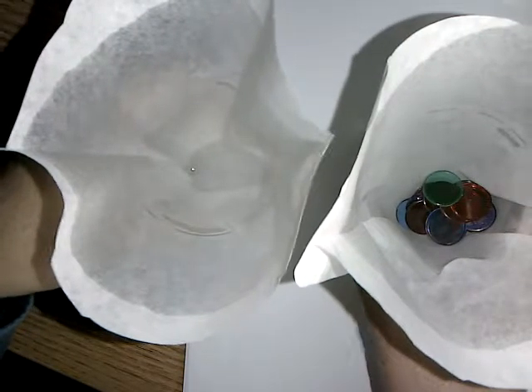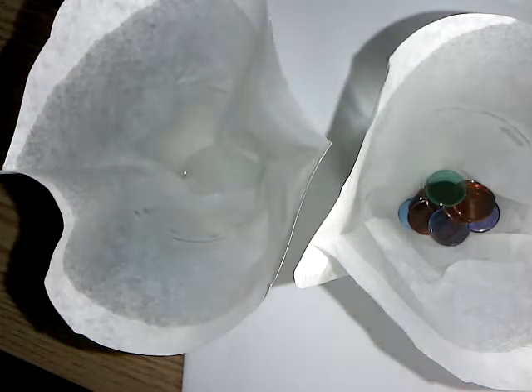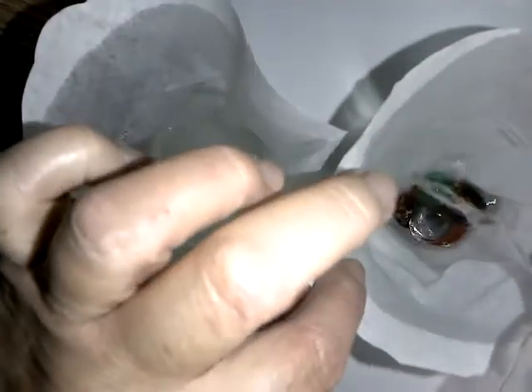Okay? So I have two beakers here, and they have a coffee filter in each beaker. Okay? And I'm going to go ahead and pour water in the first one. And I'm going to go ahead and pour water in the second one. And I want you to make some observations here.